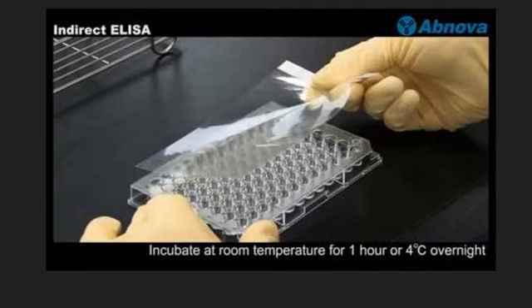Then we remove the blocking buffer. Then we wash the plate twice with PBST, phosphate buffered saline with Tween 20, and dry it this way. Then we add 100 microliters of diluted primary antibodies.